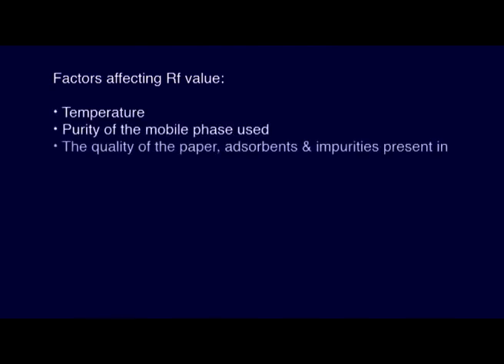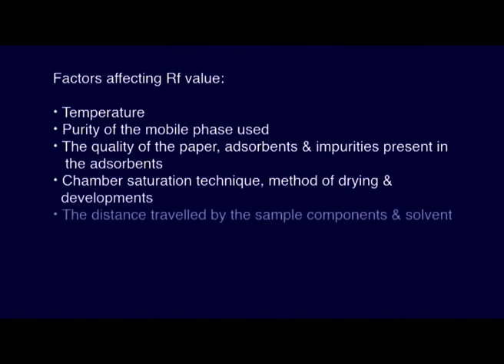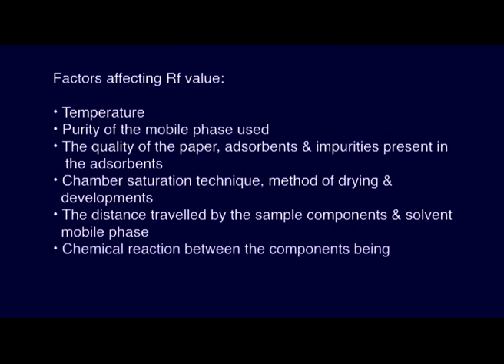There are different factors that affect the RF value of the components. Here I listed many of the factors: the temperature, purity of the mobile phase used for the separation, the quality of the paper, adsorbents, impurities present in the adsorbents, chamber saturation technique, method of drying and development we used, the distance travelled by the sample components and the solvent mobile phase, chemical reactions that may happen between the components to be separated, and pH of the solution as well.